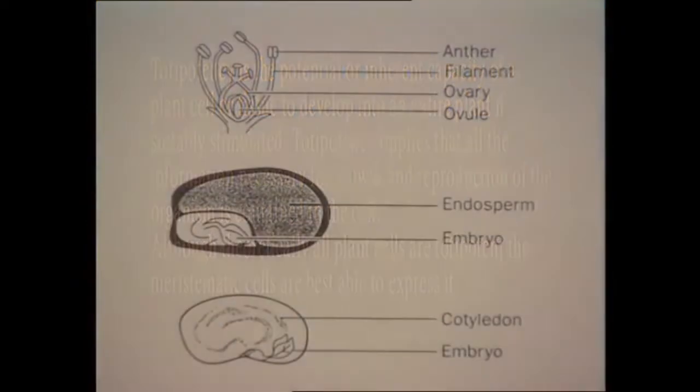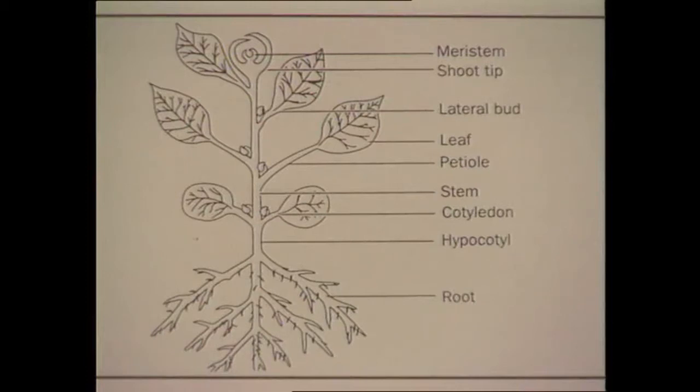The next two slides demonstrate the parts of the plant that we can use as starting plant material, and as we can see from these slides, basically any part of the plant, from roots to stem to leaf, buds, floral parts, seeds and embryos, can be utilized as starting material. There are many types of in vitro culture. These are briefly summarized in the next slide.